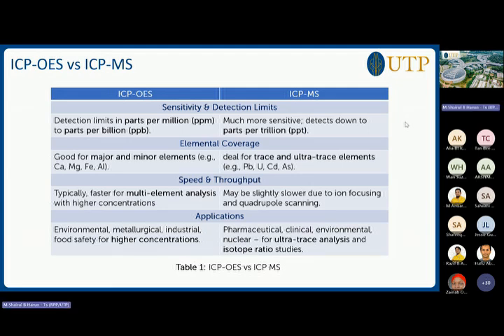And then for the application terms, environmental, metallurgical, industrial, and food safety with higher concentration are more for OES. For the MS, more on pharmaceutical, clinical, environmental, and nuclear, for ultra-trace analysis and isotope ratio studies.